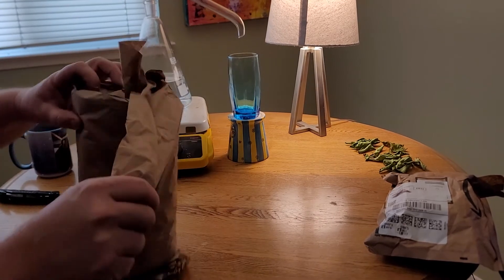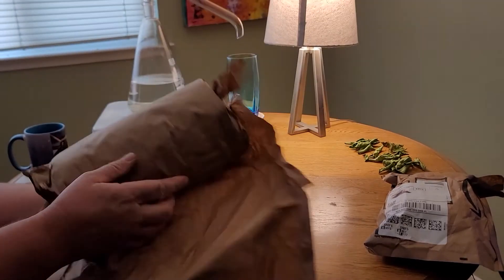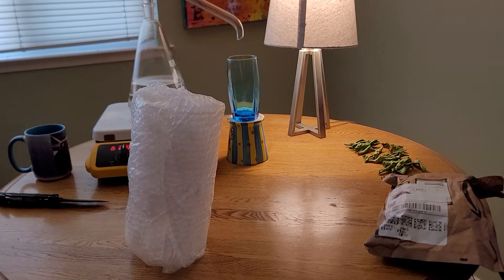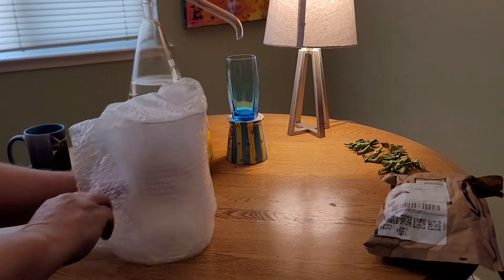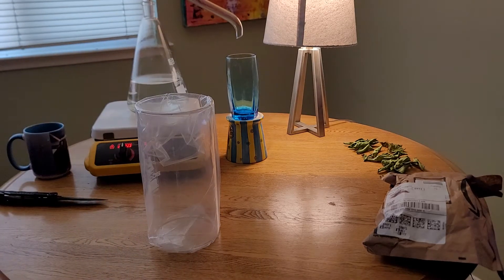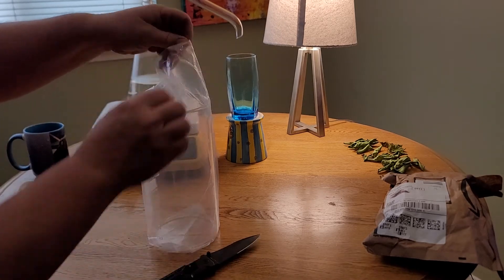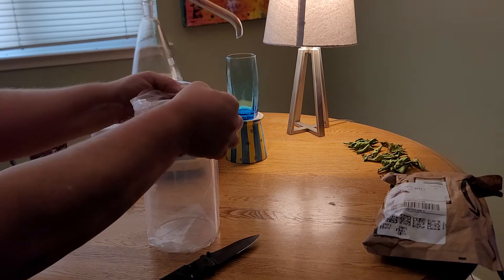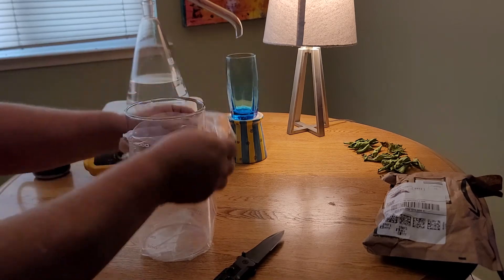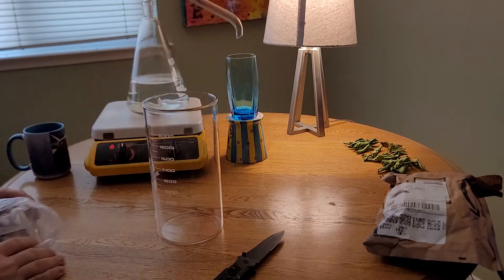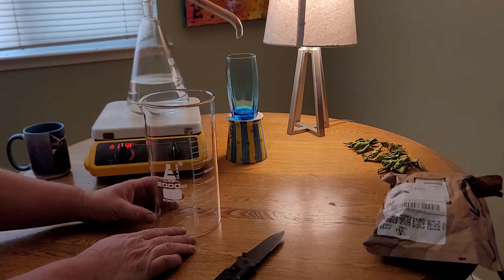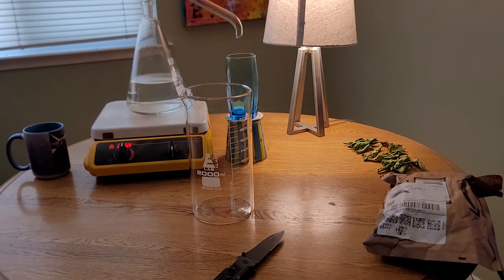This is something I've been wanting for a minute. It's a big beaker. It's very well packaged. I'm going to finish opening it up here. This is a 2000ml borosilicate glass beaker. Perfect.